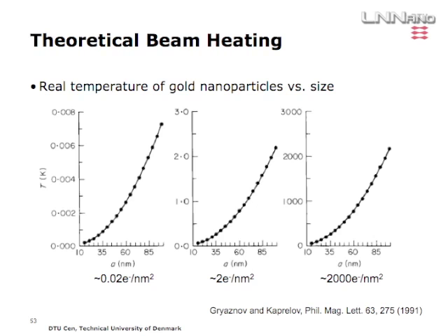When you do studies like this, you have to consider what local temperature you have, because in the furnace type holder that I showed you before, you can only measure the temperature on the outside, but what is the actual temperature in the beam? And if you look in the literature for studies like that, how much does the beam heat your sample? It's difficult to find. I've only found very few of them.